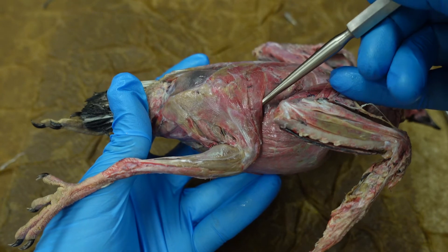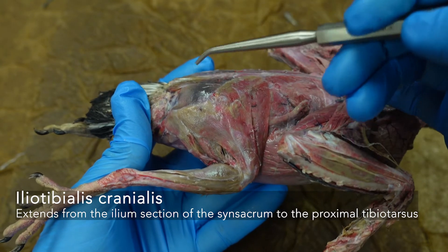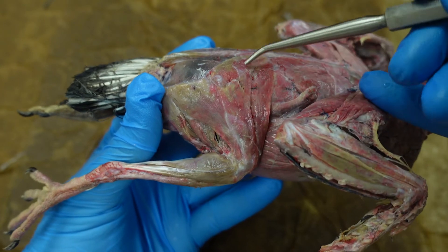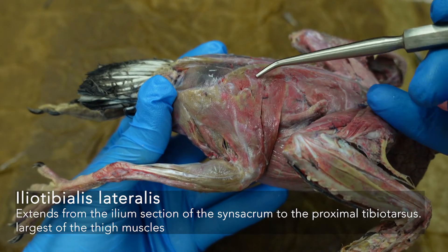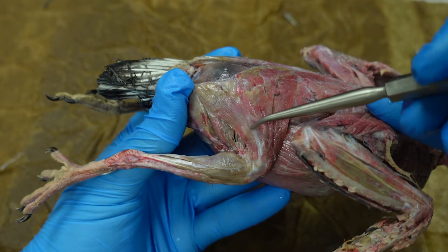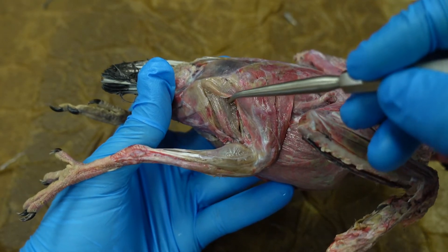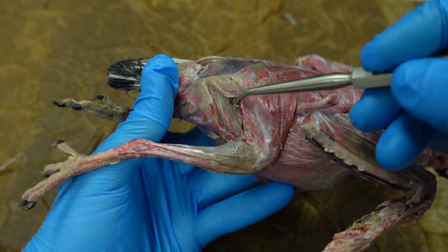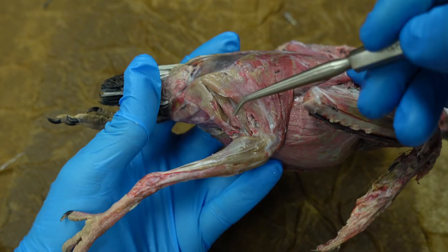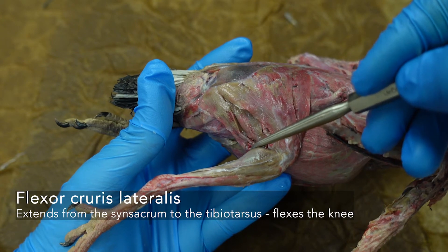We have our iliotibialis cranialis, going from the ilium — the ilium part of that synsacrum — down to the tibiotarsus. Then this larger complex here is our iliotibialis lateralis, this whole big triangular muscle — it may feel like it divides into two. Posterior to that, a little bit underneath, we have our iliofibularis, going to the fibula. And on the very back edge of the leg, we have our flexor cruris lateralis.